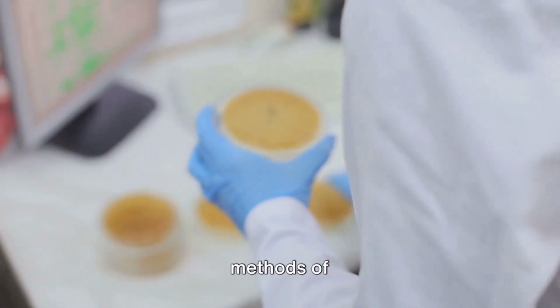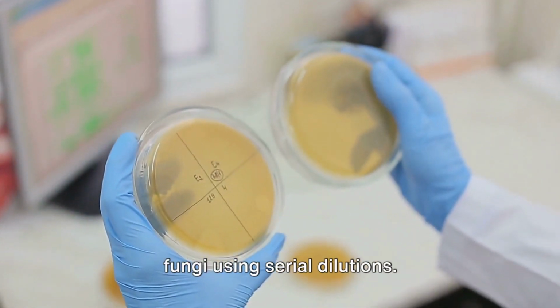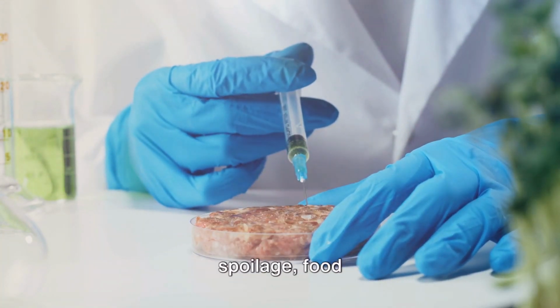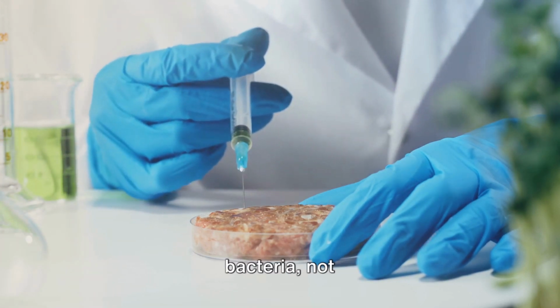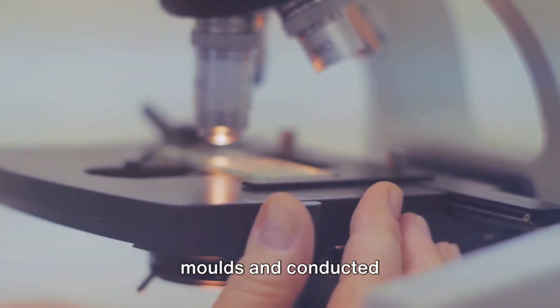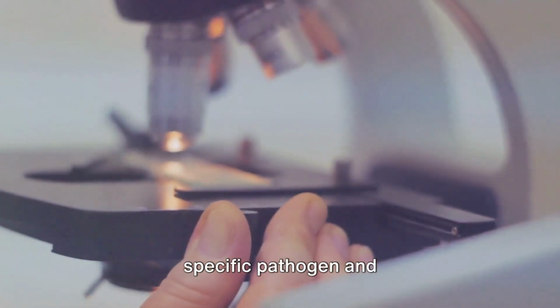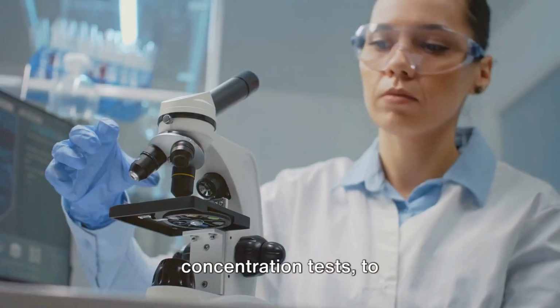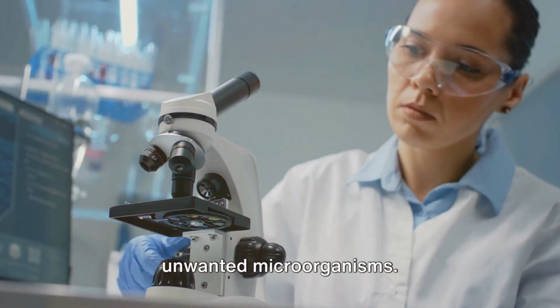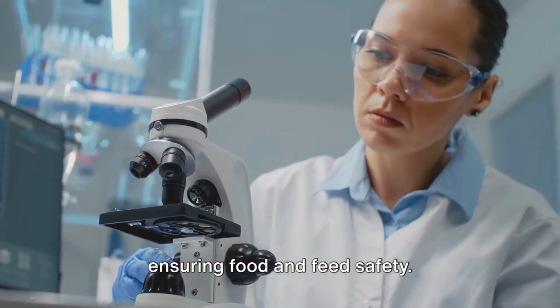We've explored various methods of sterilization, media and reagent preparation, and counting bacteria and fungi using serial dilutions. We've delved into the isolation and identification of food spoilage, food poisoning, and indicator bacteria, not forgetting probiotics. We've peered through microscopes to identify molds and conducted antibiotic sensitivity tests to determine the relevant antibiotic to be used against a specific pathogen, and minimum inhibitory concentration tests to determine the exact concentration of any substance that can be used to destroy unwanted microorganisms. All these activities play a crucial role in ensuring food and feed safety.